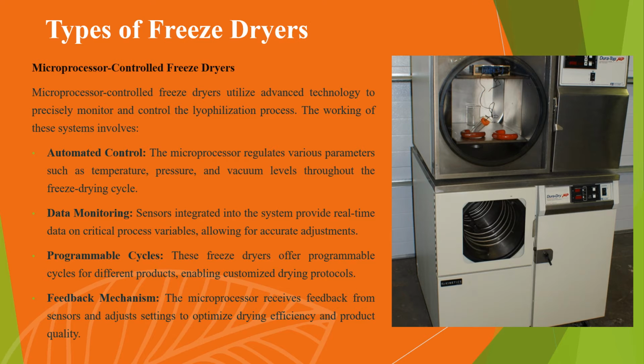Types of freeze dryer. The next one is the microprocessor control freeze dryer, which uses advanced technology to precisely monitor and control the lyophilization process. The working of the system involves automated control, which regulates various parameters such as temperature, pressure, and vacuum levels throughout the freeze drying cycle.